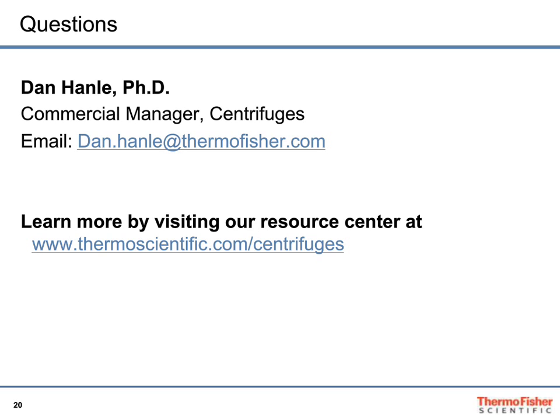Great, thank you. Now, if you're working with a specific type of tube, how do you find the centrifuge that's going to work best for you? Yeah, good question. That's actually a pretty common question I get. What you get is the user's got a tube in their hand, and they're showing it to you. Say, I want to spin that. And, of course, getting a knowledgeable person, a salesperson or something who knows the product line well and can say, oh, yeah, here they are, and just run it off to you is probably a good place to go. You can go to the literature.